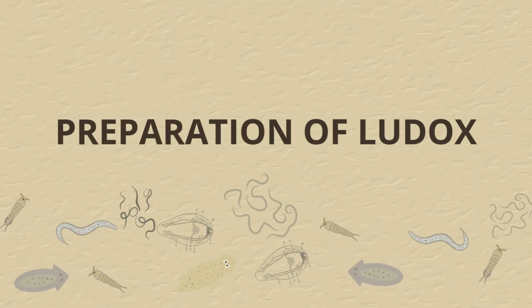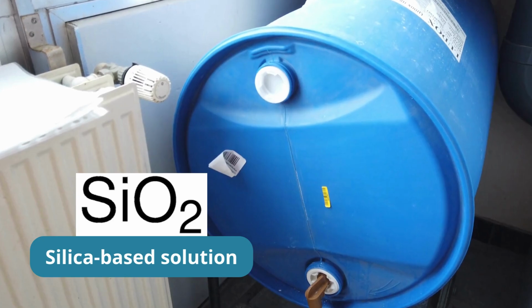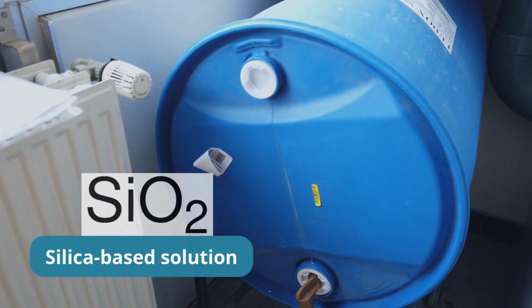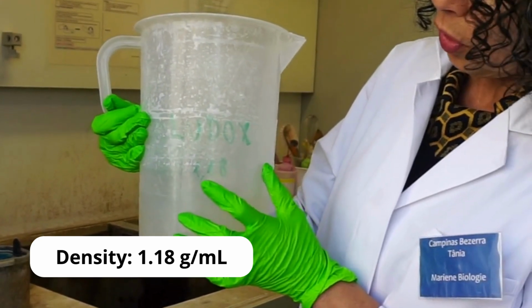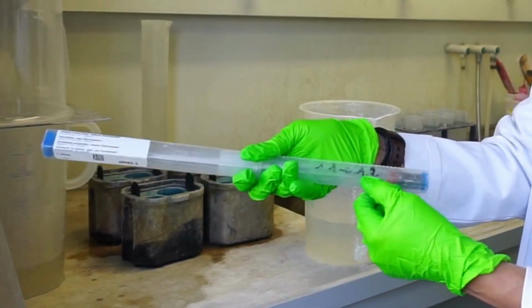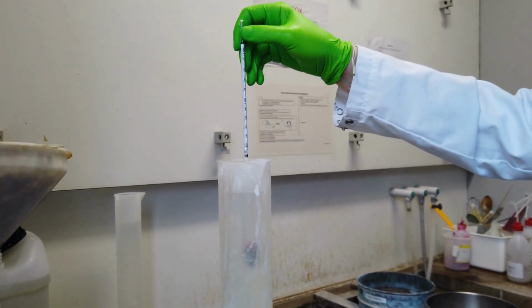Preparation of Ludox. Ludox is a silica-based chemical solution. It comes with a concentration of 1.4 grams per milliliter and is diluted to a density of 1.18 grams per milliliter. This ensures that most of the meiobenthic organisms can be extracted from the sediment. A densitometer from 1.1 to 1.2 grams per milliliter is used to measure the density of the Ludox.